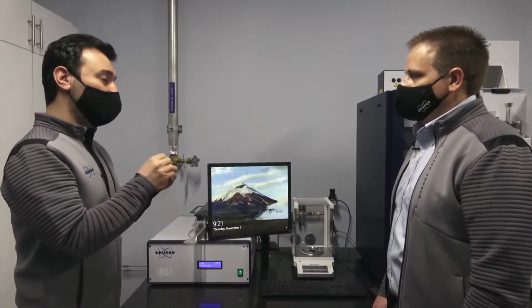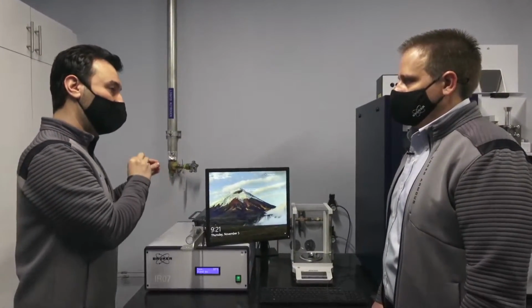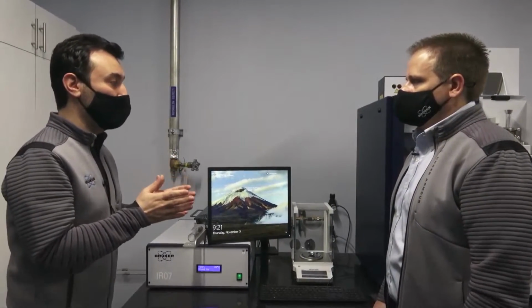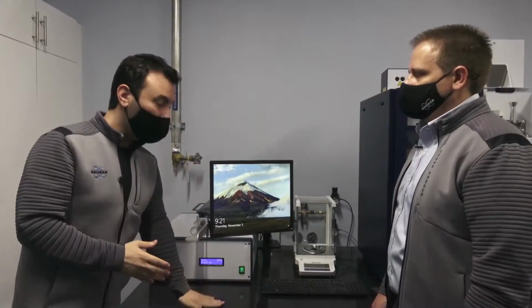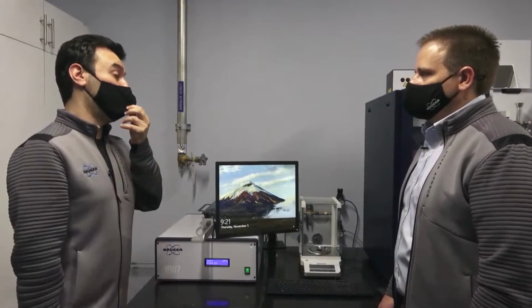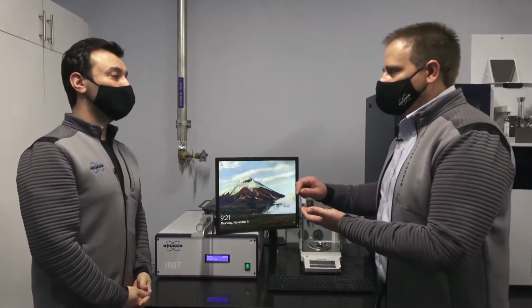So just after the production of a metal or just after the welding, you would like to put the sample in the infrared furnace and analyze that diffusible hydrogen. But you have to do it just after the production because by the nature of this diffusible hydrogen, if you just put it here on your desk, that diffusible hydrogen will come out of the sample in less than 72 hours, actually.